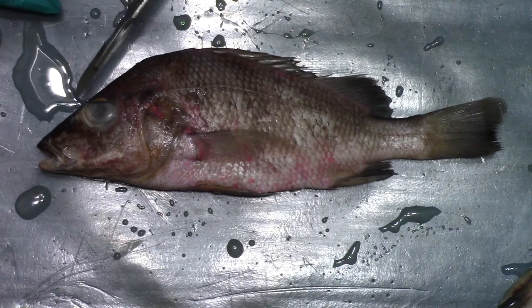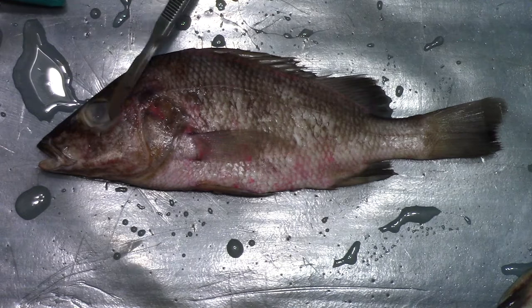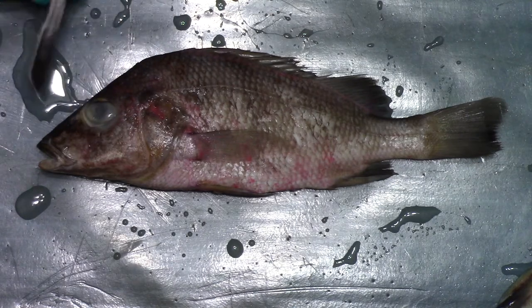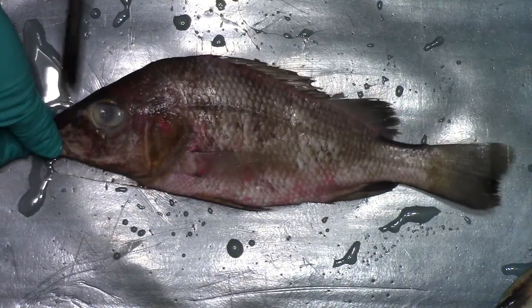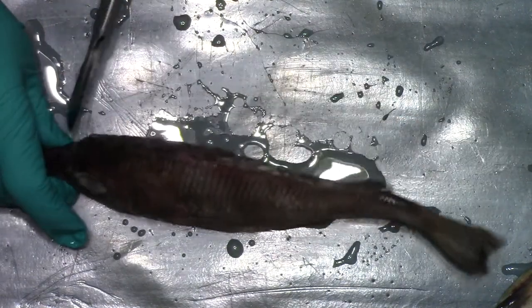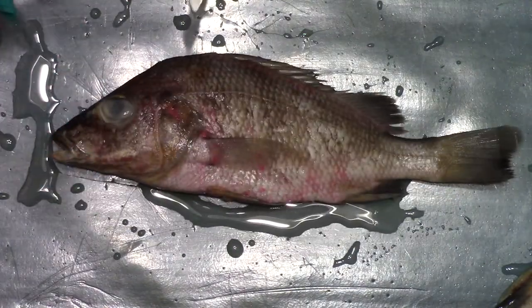You can see the eye, which has been sort of oddly glazed over from the preservative. And there's one of the nares right here — there are two of them. I'll show them close up in a minute.